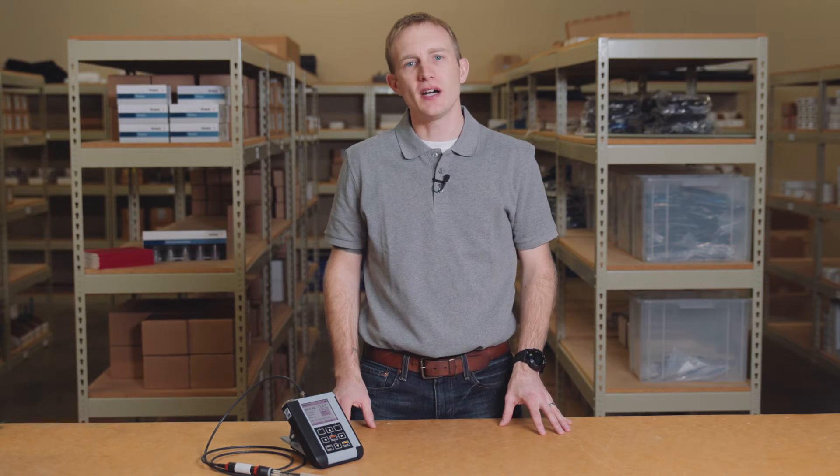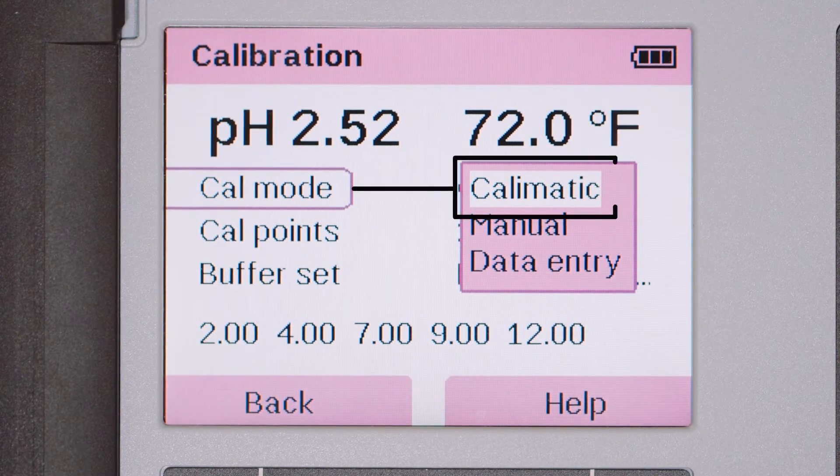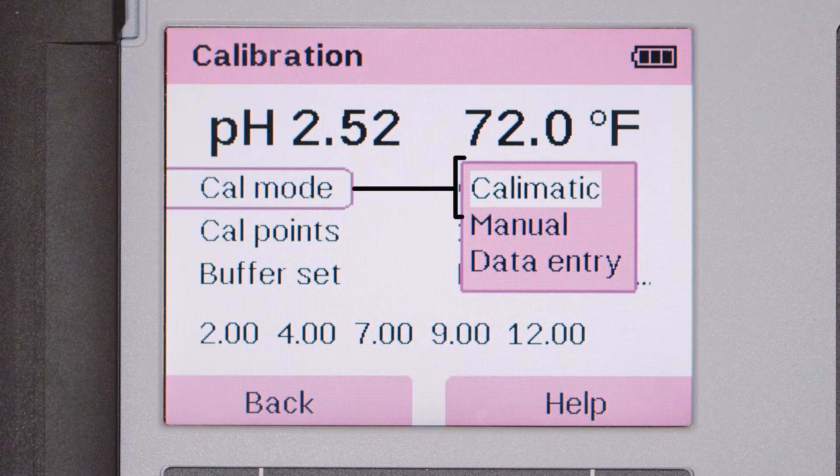One final troubleshooting tip is linked to the setup of your Portavo's calibration menu. The Portavo is equipped with a convenient automatic calibration feature called Calmatic. Calmatic ensures a more accurate and precise calibration with automatic buffer recognition and temperature compensation.